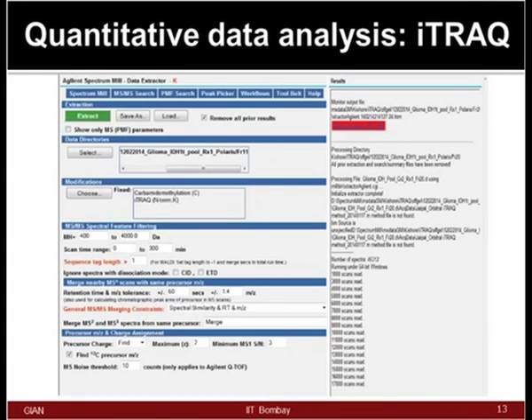One platform which you will see today is based on the commercial setup we have available here, but you can still use even Mascot if you do not have the specialized software available. You can still use Mascot for doing data analysis. The only thing is, if you have access to the Mascot complete database, probably your search will be much more refined.